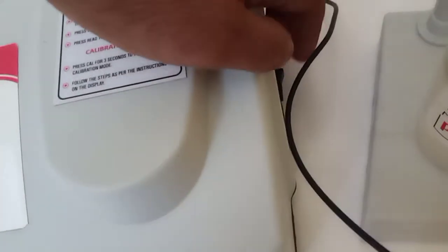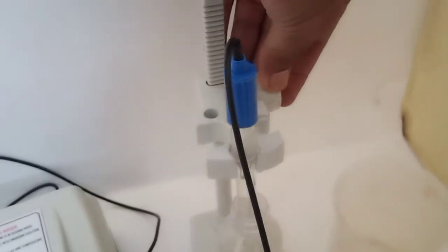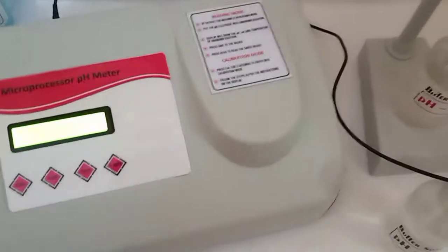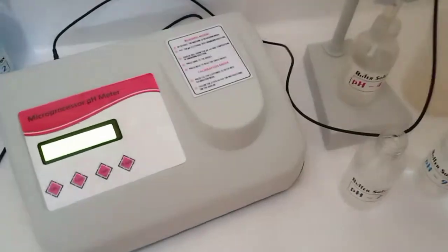At the back side of the instrument there is a pH electrode socket and a power socket. This is the main power button, and this is the pH electrode stand — using this knob we can adjust it as per requirement. These are the buffers: 4, 7, and 9.2 pH. First of all we will calibrate the machine properly. Wash the electrode.